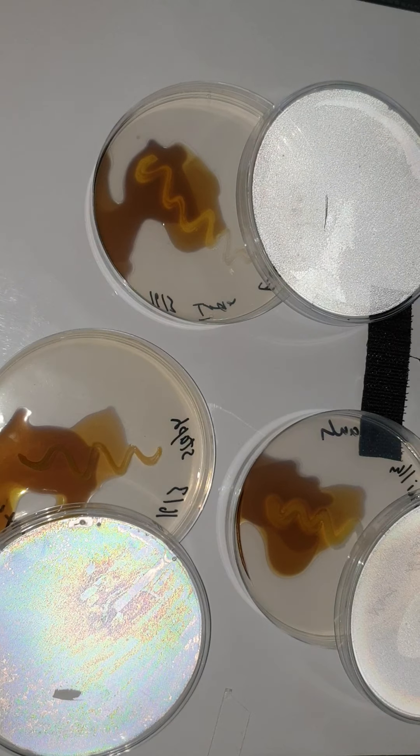Here is E. coli. If you look at the area around the colonies — all the way around the colonies — it's dark blue. The dark blue color indicates that starch is still there and it was not digested by E. coli.